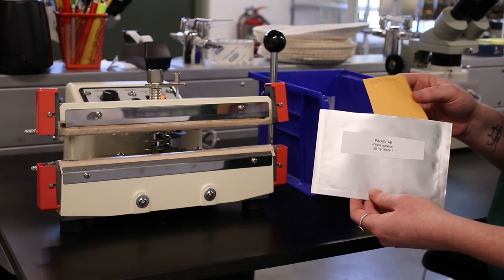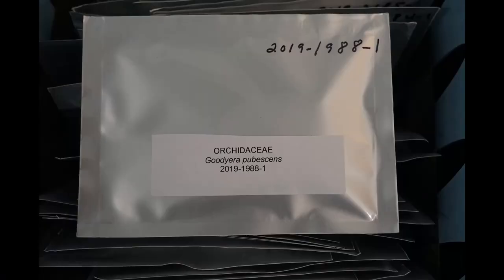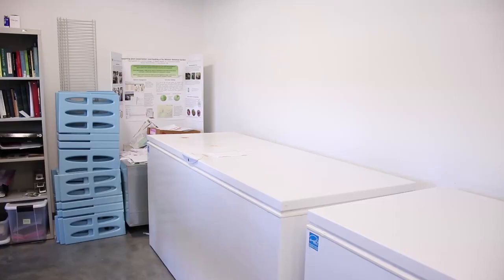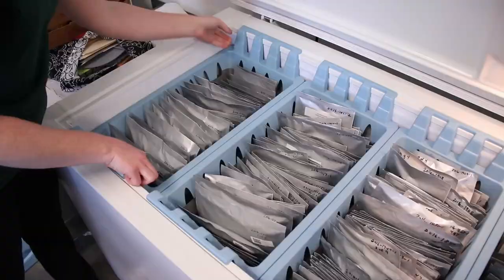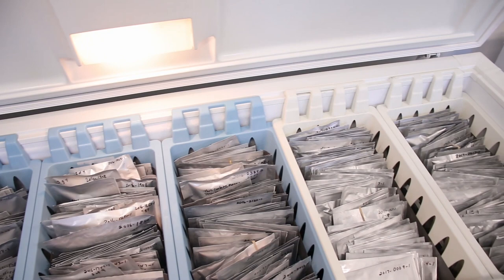After we get a final AW and weight, the seeds are put into an envelope and sealed in a foil packet that is labeled with the accession number assigned by the plant records team at the garden. Here are the freezers where we store the seed. They are filed in chronological order inside and are backed up by generators in case of power failure.